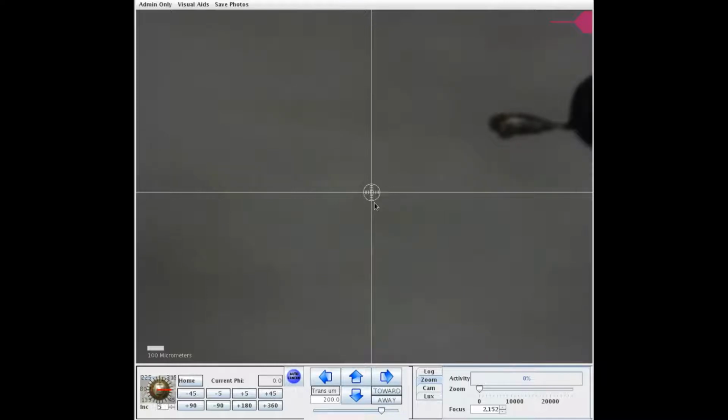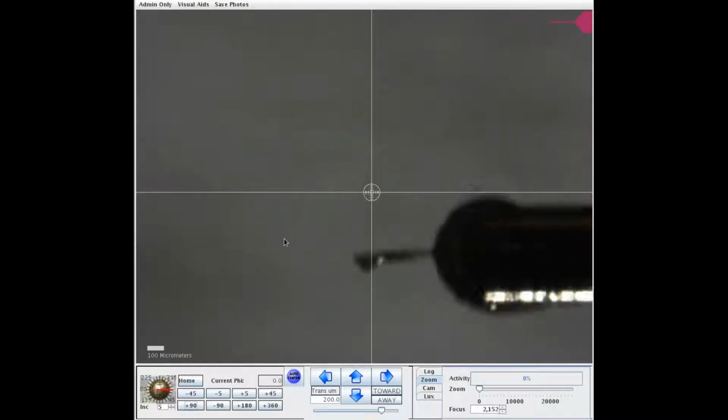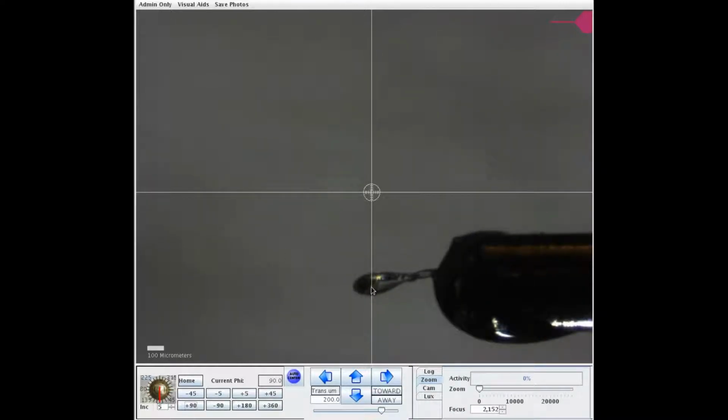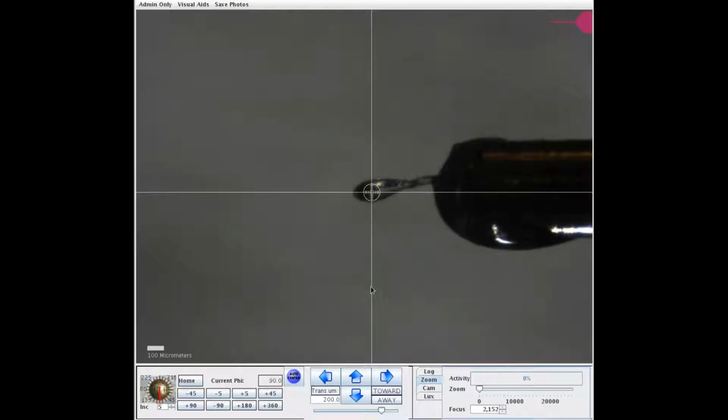The simplest case, you've just mounted a crystal. It's visible in the interface. You double click on your sample and it gets moved to the beam center. Then you want to get the third dimension. You rotate by 90 degrees and double click again. Okay, that's a good initial centering.